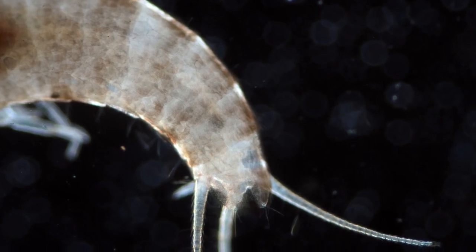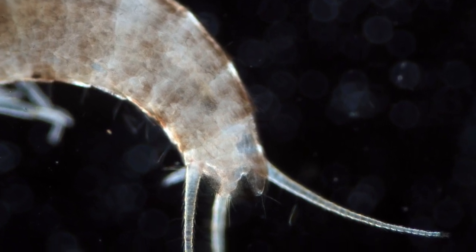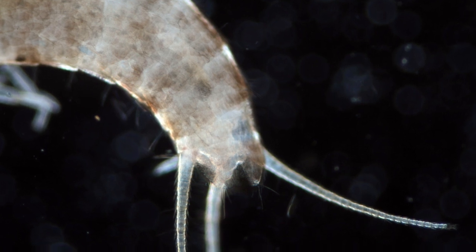Again a dark field image of the same region, and I could actually observe that the color changed a little bit over the weeks as the mounting medium started to infiltrate. Now this is very interesting — do you see the dark and bright stripes? I think these are the stripes of the skeletal muscles. And these are some scales of the insect on the outside, and they also have stripes. I hope you kind of enjoyed this specimen — it's actually the first time for me to observe a silverfish. Have a nice day, all the best, bye bye.